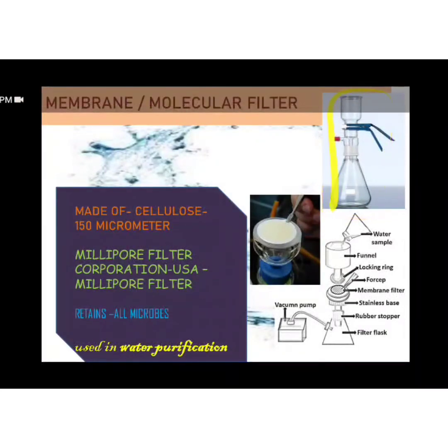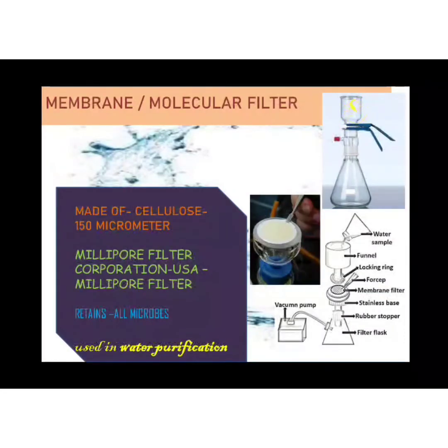This is how the setup is. Here this is the place where the sample is added. Here the membrane filter is placed. This is the membrane filter. If you see the skeletal structure, this is the place where the sample is poured, here the membrane filter is added, and here the filtrate is collected. The pure sample is collected. This entire setup is connected to a vacuum, and since it is connected to a vacuum, there is a suction force. When compared to all other kinds of filters, this acts fast, because it happens through suction.